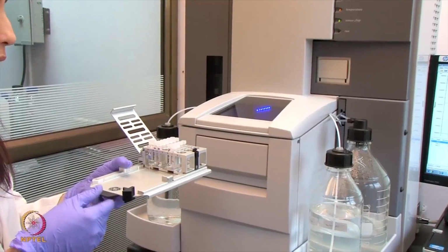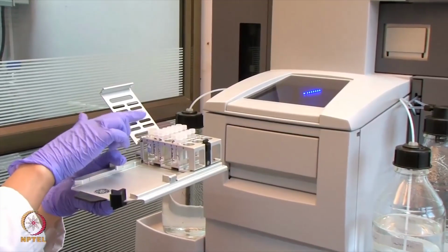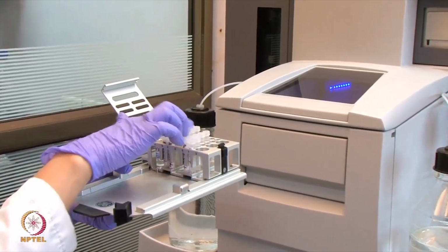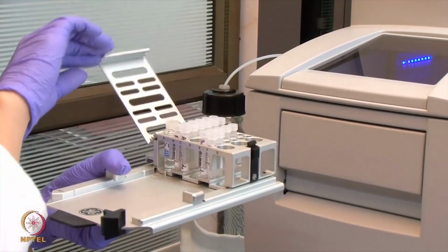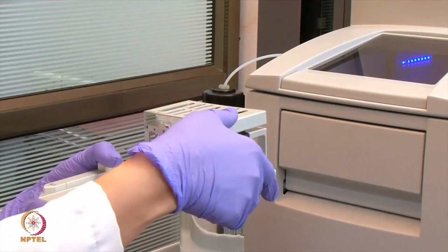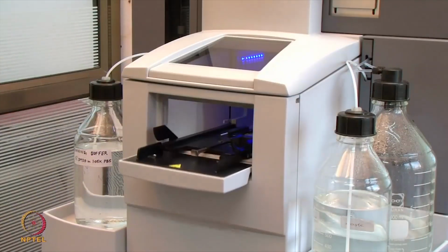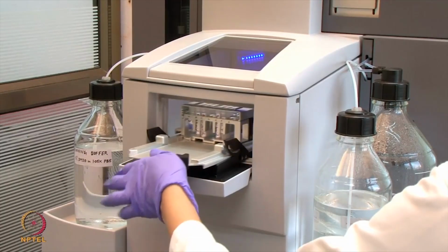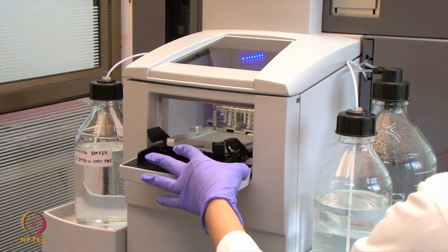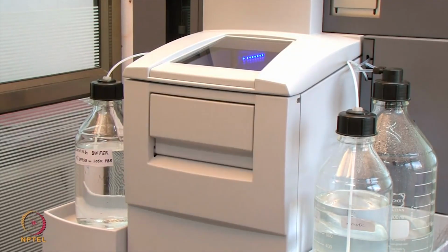We have now placed all our tubes inside the rack, including the wash solution, the samples, the solvent correction solutions, the startup solution and the negative control. We are placing this rack inside the system to start with our screening assay. We will now start with our run as demonstrated in the earlier lectures.